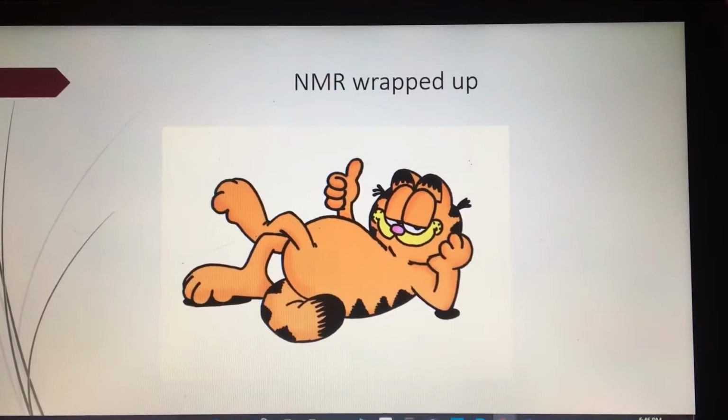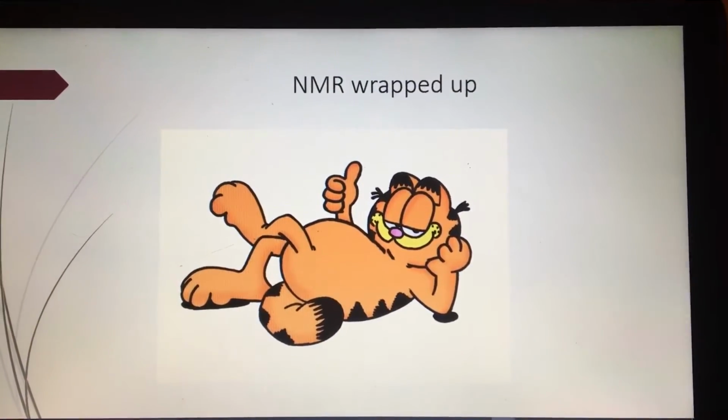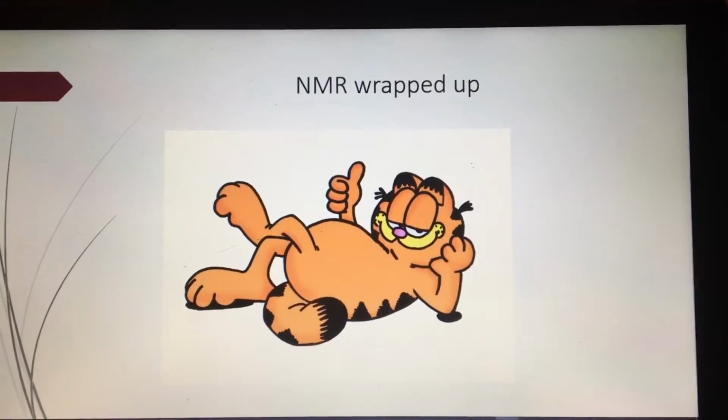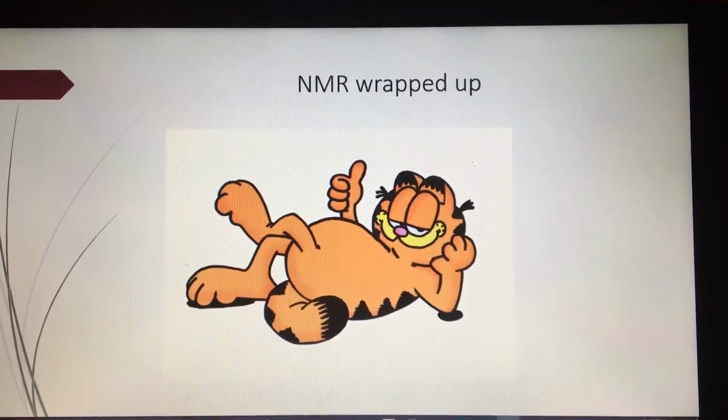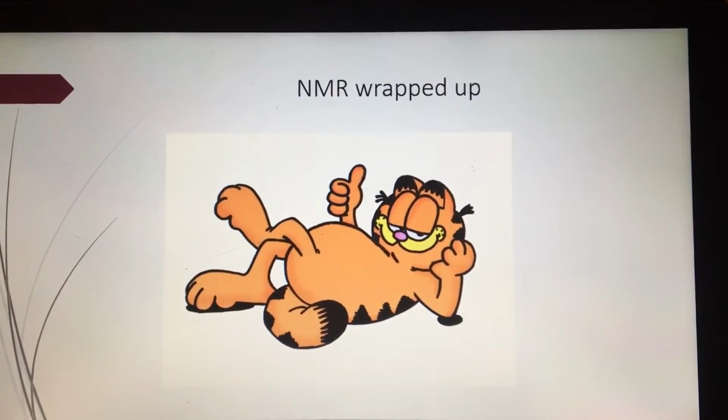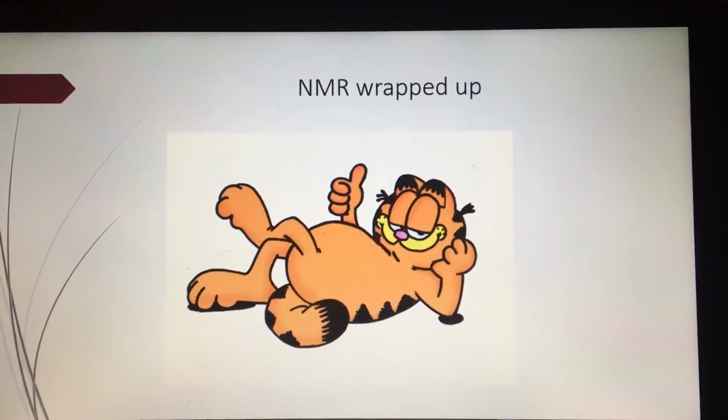The discovery of NMR by two gentlemen in 1945 may have been one of the most beneficial discoveries in the past 100 years. Without NMR, it would be very hard to be able to properly identify the chemical characteristics of an unknown sample. Throughout the history of NMR, the process has stayed the same, but the applications have developed into very sophisticated and beneficial tests.